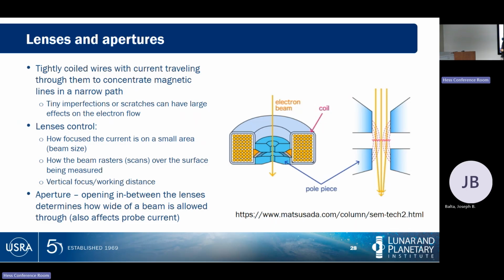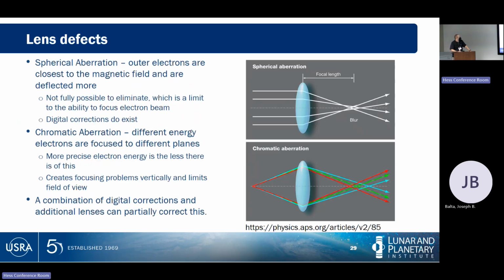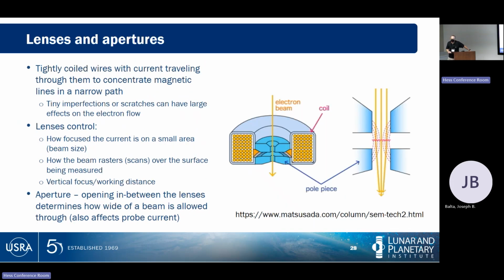So on our SEM, the specific setting that will control beam current is the aperture. This is one of the tools you get to select on an electron microscope, which is the current. We will also see that you get to set accelerating voltage. There'll be important reasons for doing that. And as you're going through and focusing an electron beam onto your sample, you'll be adjusting a few other parameters to correct for whatever else is happening in the microscope over time.